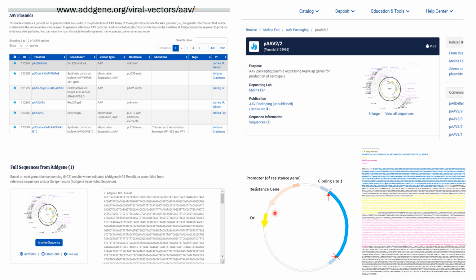So it's a very nice habit to copy paste your sequence and to identify by colors the different regions. How do you identify the different regions? Yes, you hover your mouse over the different parts, they will be highlighted here. So the only thing that you have to do is identify the different regions and highlight it in your Word. So this is a simple way to have your sequence well organized in Word.